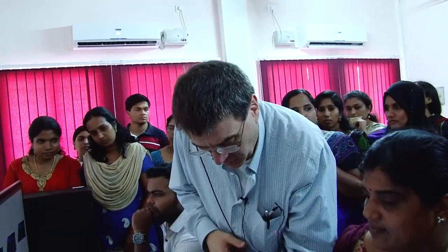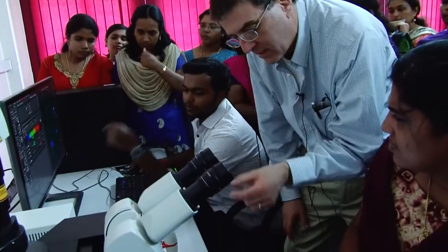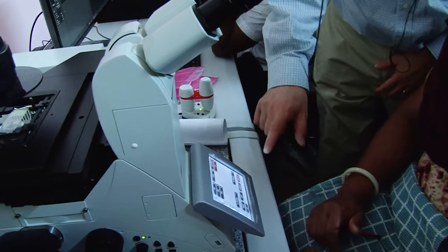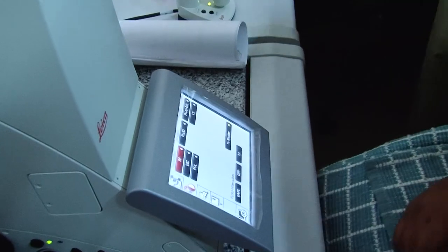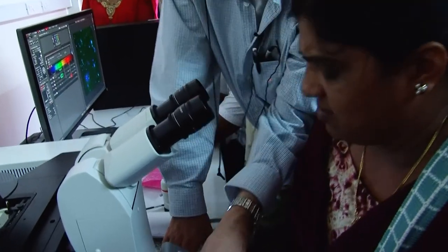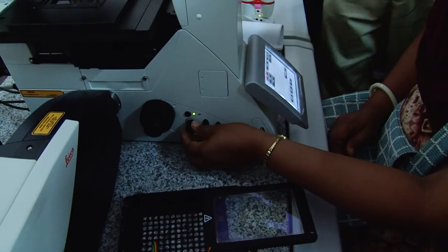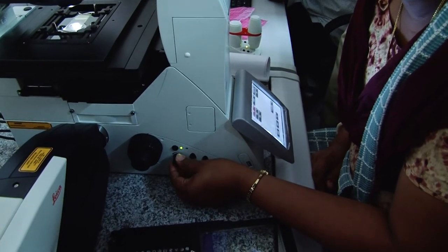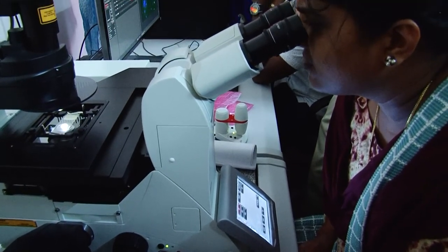Okay, so we're gonna go back to, so stop live. I think you have it stopped now anyway, yeah, right? Okay. So hit this button here, BF. Okay, so you got to hear a click, and then the shutter's on. So look through here. Do you see anything? Is it too bright? It's too bright. Okay, so if it's too bright, turn this back towards you. Turn this knob right here. This one. Take a look through there. This one? Yeah. Turn it back towards you, I think. It makes the light less, right? The light's not so bright. Do you see anything?